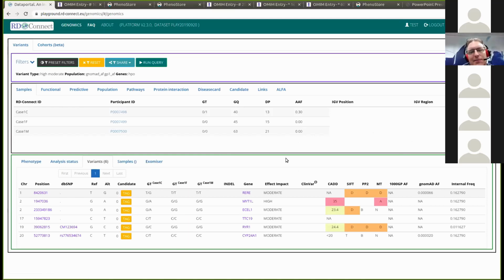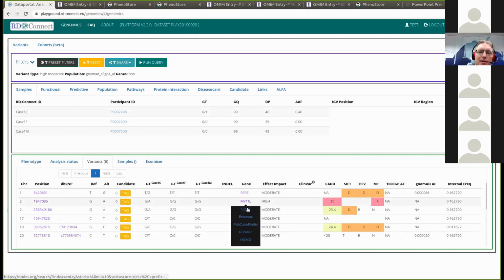Anyway, six variants would usually be enough that you can handle it manually, right? You can see which ones look most informative from the color coding, but this color coding is just telling you how likely the variant is to have an impact on the gene. It doesn't mean that the gene is necessarily involved in disease, right?